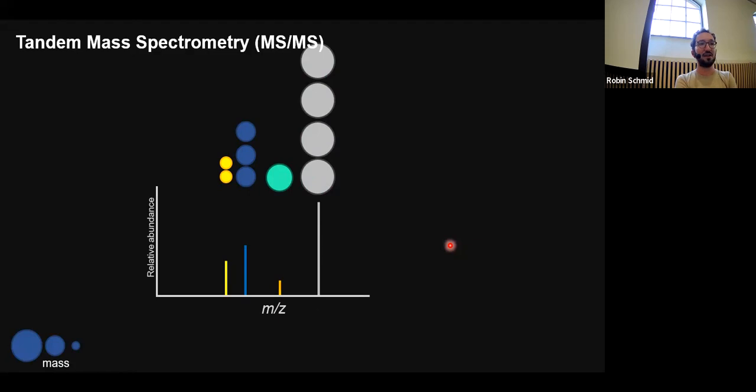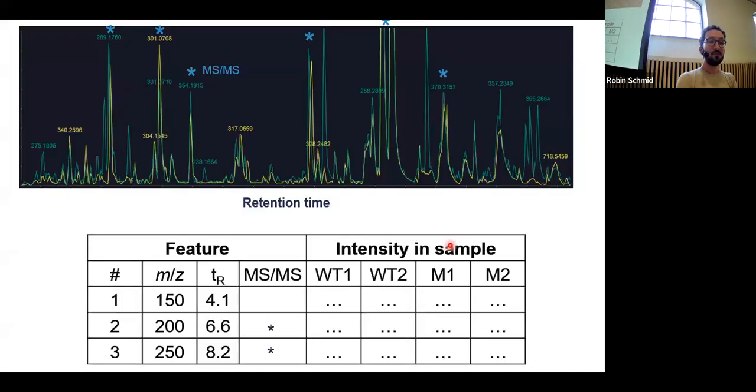And Corinna already said that it's very important to look at the molecule and also see where the charge is in the beginning. It's not very obvious very often because in gas phase, ionization works very differently than we expect it to do. So it's very important to just expect the charge somewhere, and then it's going to move around and trigger some fragmentations. Only the charged ions we can see, and then everything else is going to be neutral losses. And so if you look at a structure, we can then see where it breaks down.